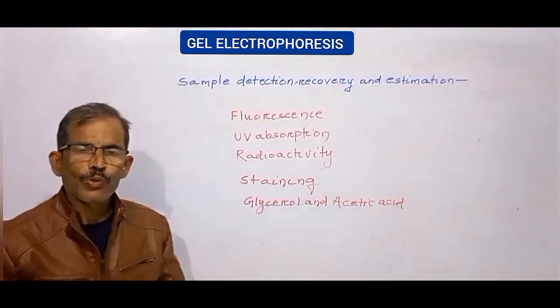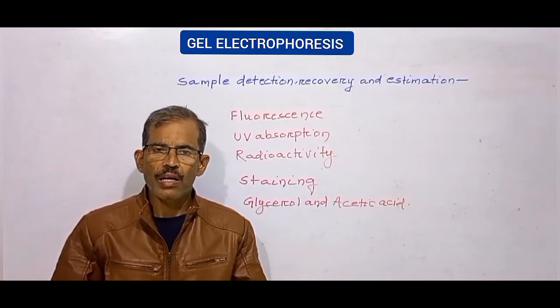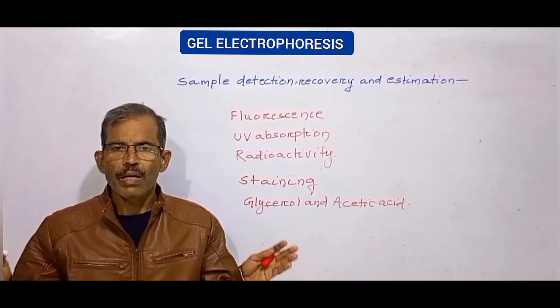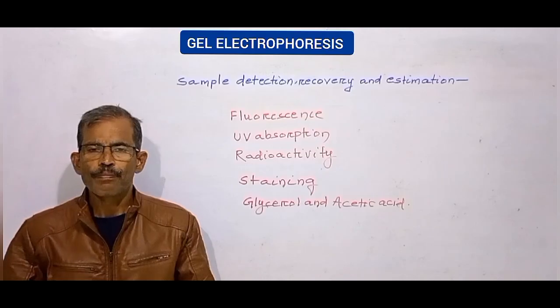If one has to estimate the resolved components accurately, then the compounds are eluted from the gel and then estimated by spectrophotometry. Applications of gel electrophoresis.